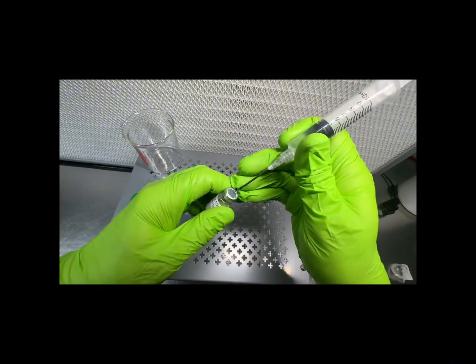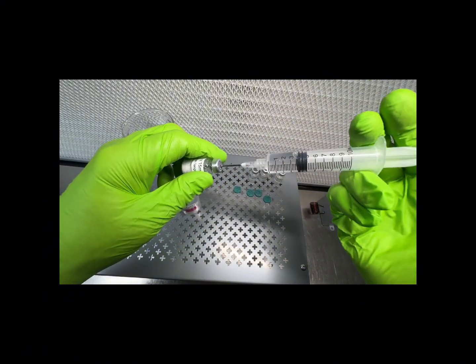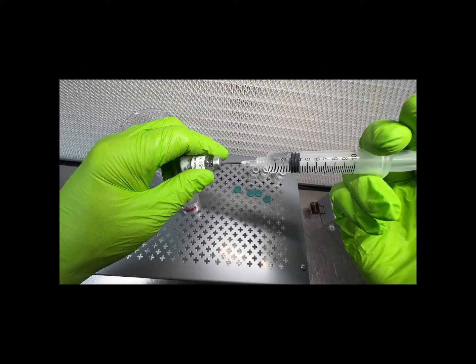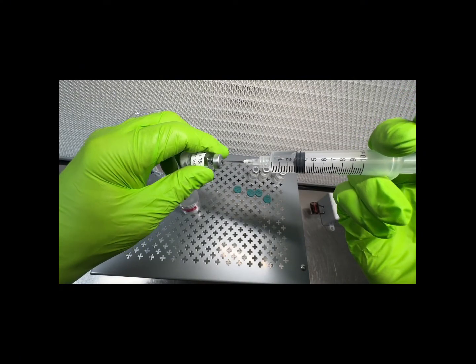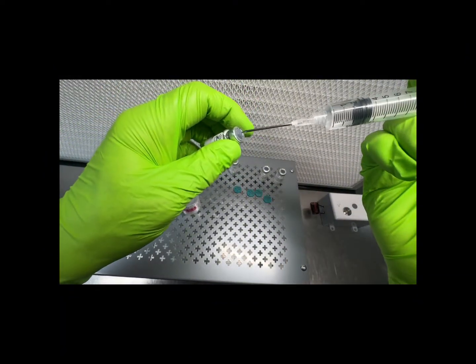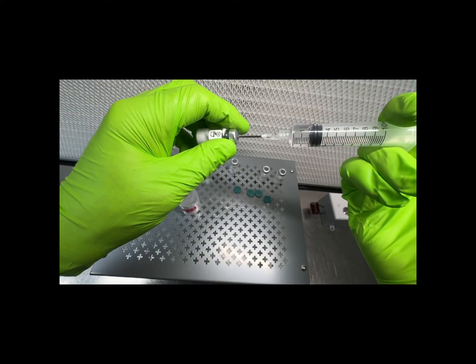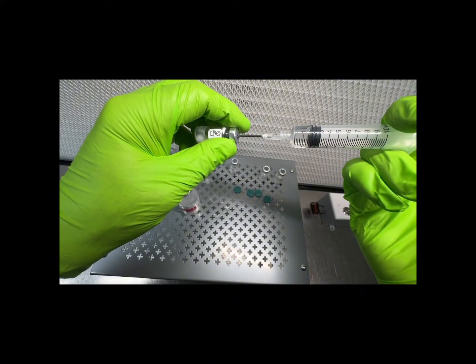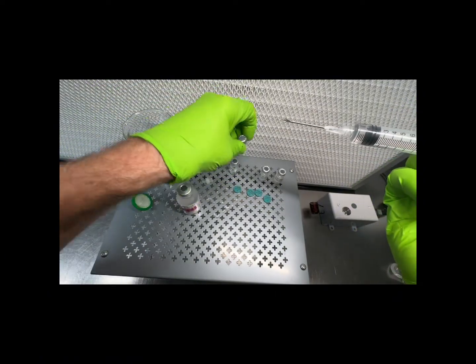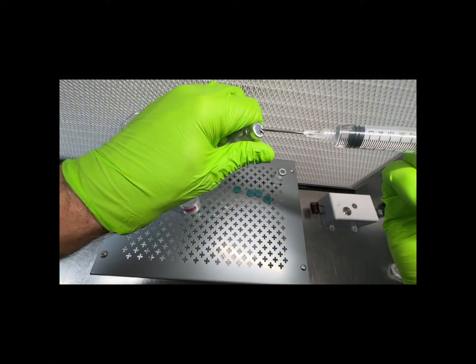And then try to get exactly a milliliter in each of these. Oops, a little bit of drip there. I'm using a big needle just to make this super easy to reconstitute and quick for the video. So we'll probably end up going back and getting just a little bit more just to try to even it out. Now we're down to 1.5. Okay.